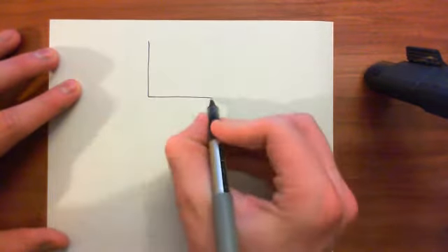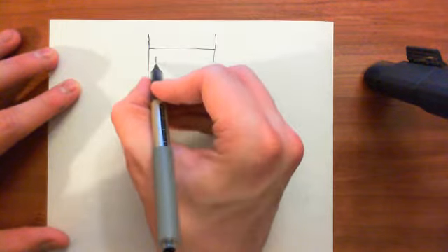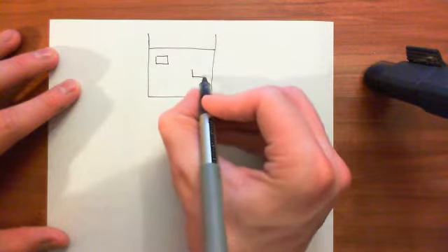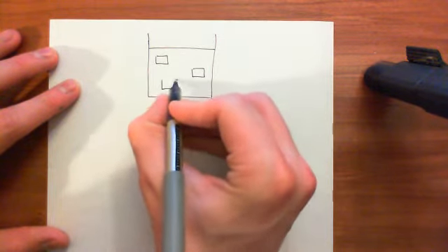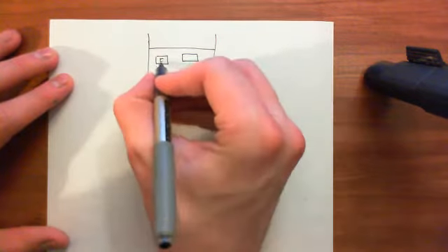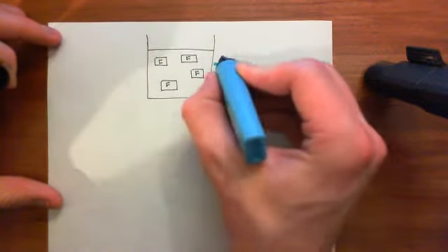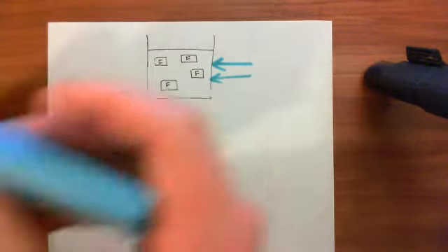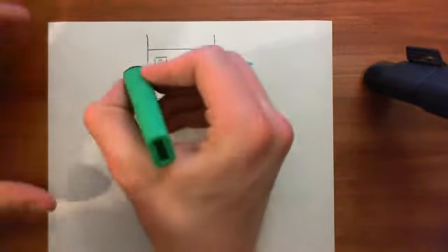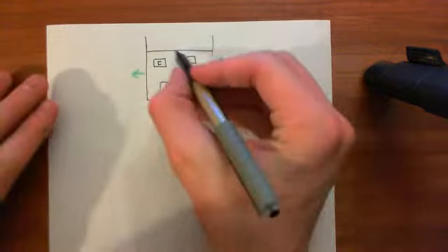Okay, so basically, if we have a solution here, like so, and we've got loads of these Fluo-4 molecules here, and let's say initially we have a solution where there are no calcium ions, then the fluorescent properties of these Fluo-4 molecules are very bad. I'm shining loads and loads of blue light onto my flask, but the amount of green light that I'm getting off is, you know, pretty pathetic. Now what I'm going to do is add a little bit of calcium.